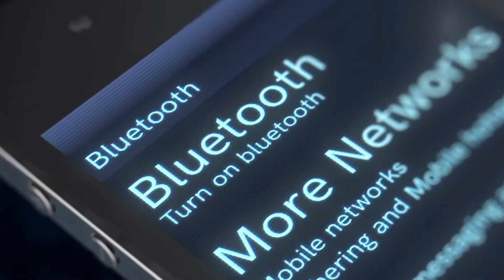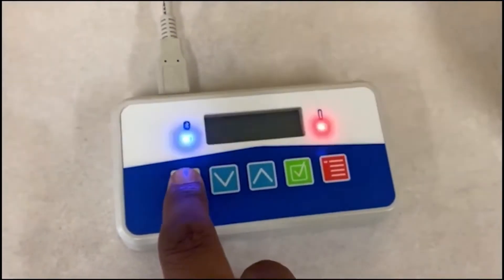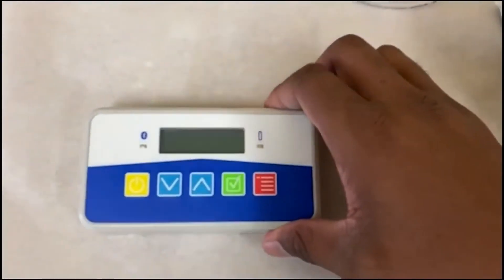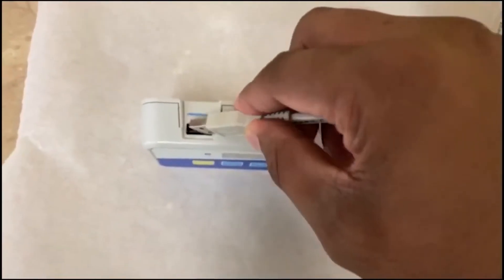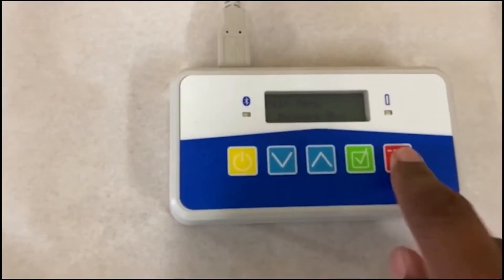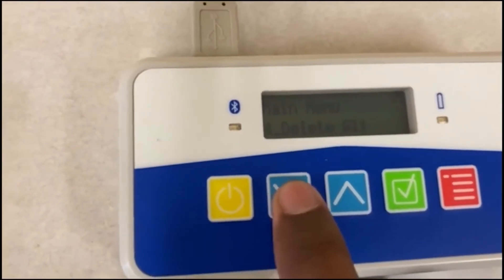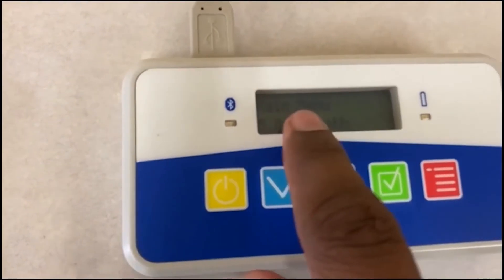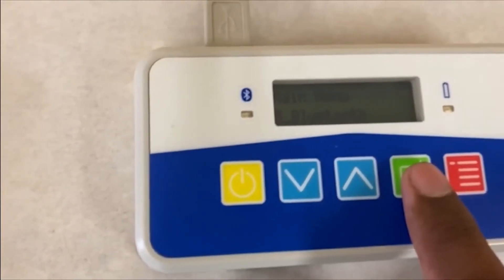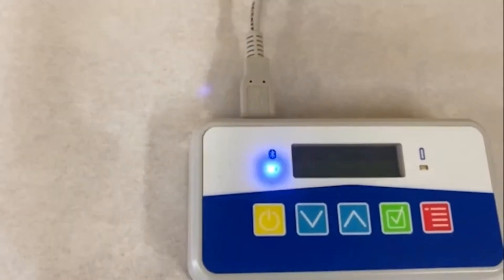Turn on Bluetooth on your mobile device. Turn on the PBM using the yellow Power button and connect it to the PhotonMaster using the cord provided. Press the red Menu button on the PBM and then use the blue navigation buttons to reach the Bluetooth menu. Press the green Select button on the PBM to select the Bluetooth option and the Bluetooth light will start to blink.